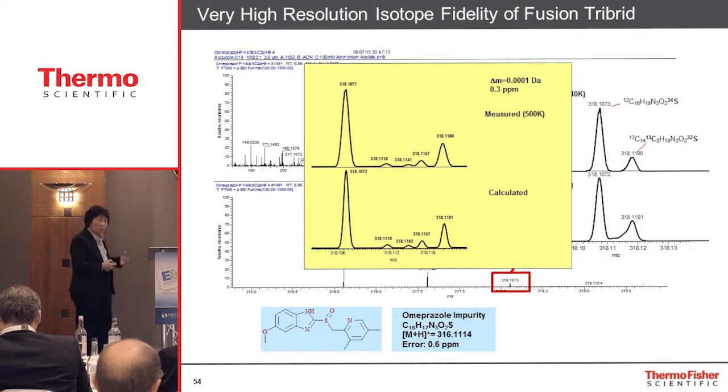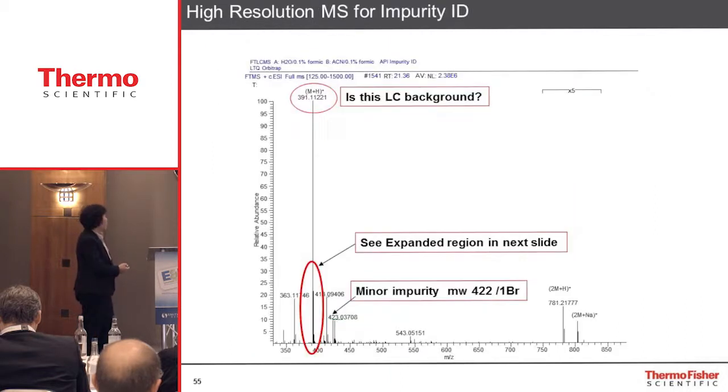So that's why we say a high-resolution mass spec gives you all those benefits. Horizontally, you see what kind of elements are present in your unknown. And then vertically, by their relative abundance, you can calculate how many. So that's why we say you can do atom counting. Okay, we are all too familiar with 391, but now all the 391 are the usual suspects, right?